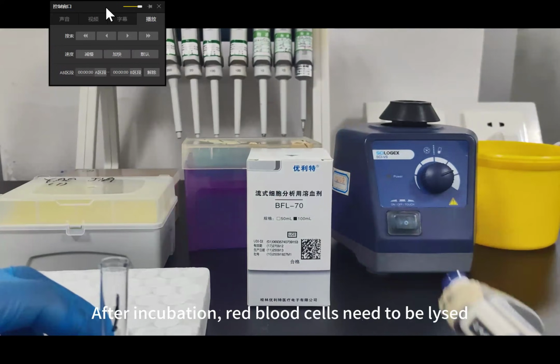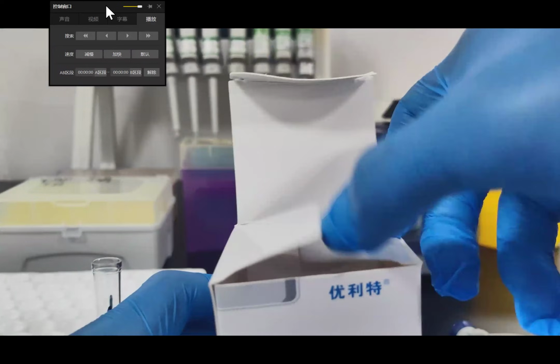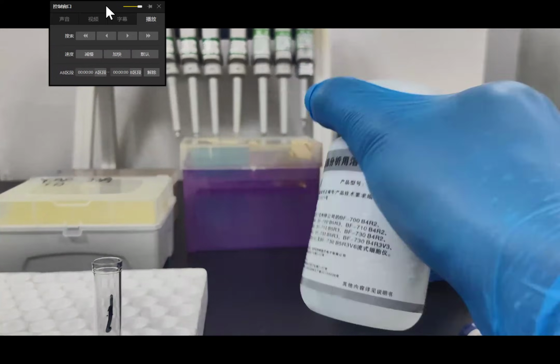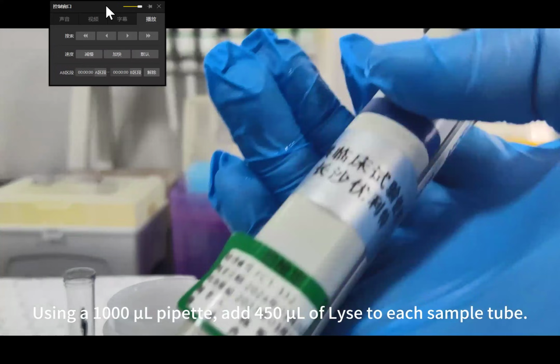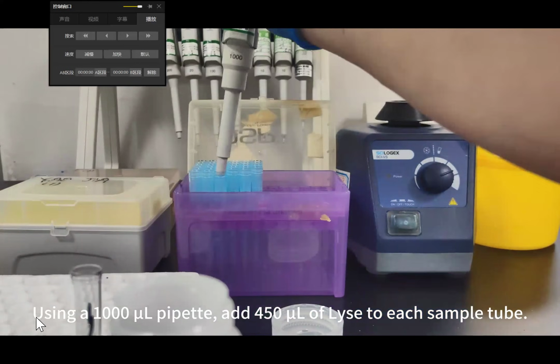After incubation, red blood cells need to be lysed. Mix the lyse thoroughly. Using a 1000 microliter pipette, add 450 microliter of lyse to each sample tube.